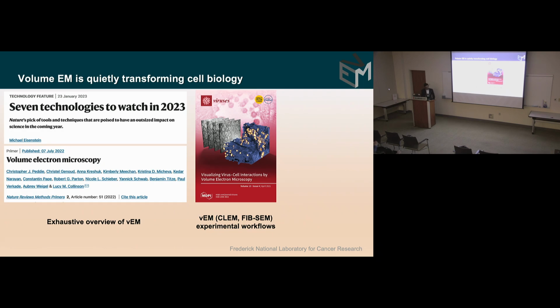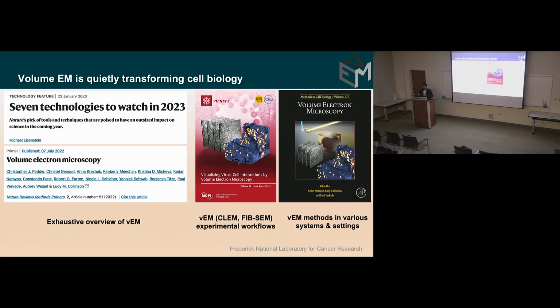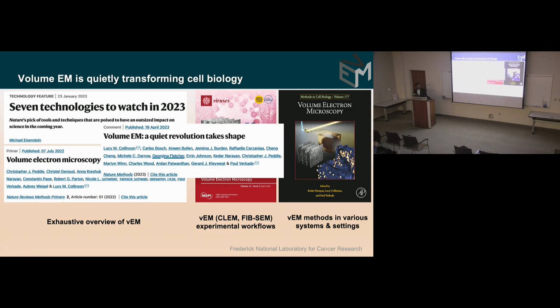There's a couple of papers that have a slightly more practical description of how to generate volume EM data sets. And if you just want a very simple commentary, a few of us again wrote this in Nature Methods earlier this year that just talks about what volume EM is for a beginner. And it's, if I might say so myself, a pretty interesting read.